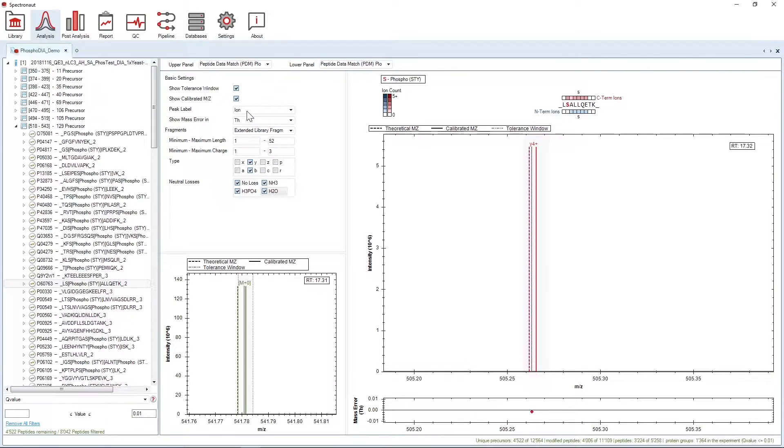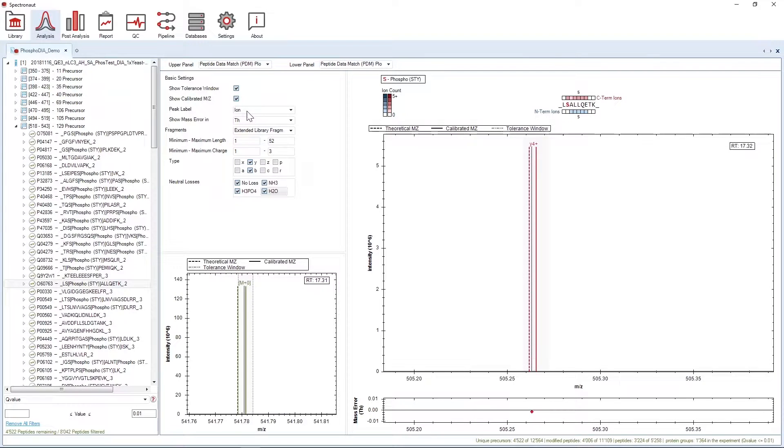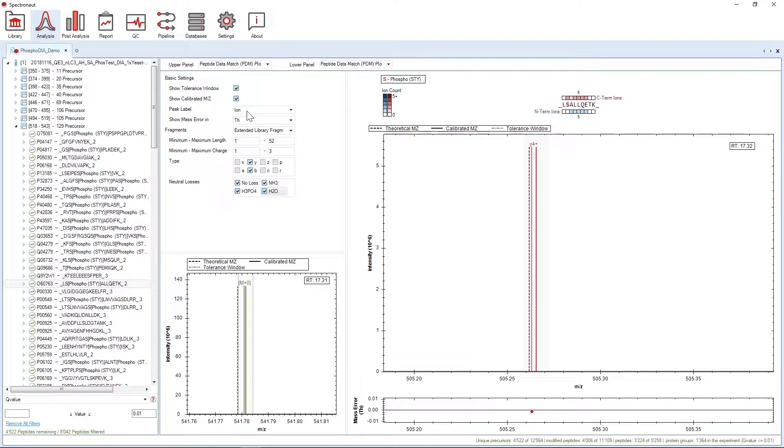With Peak Label, you can choose the label that is displayed on the peaks of the MS1 and the MS2 scans. By default, it is the ion name. However, you can also change it to the MZ value.